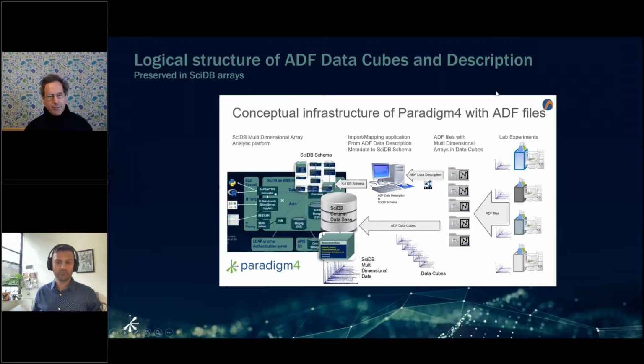So this is a mashup slide that was created by Amnon, which I really liked. And it really speaks to the fact that the data that's captured in the ADF is a set of matrices, right? And the metadata itself, of course, is represented in the graph format. But as anyone who knows something about matrix algebra knows, graphs are actually nicely represented in matrices as well.